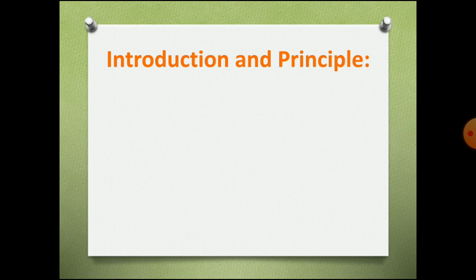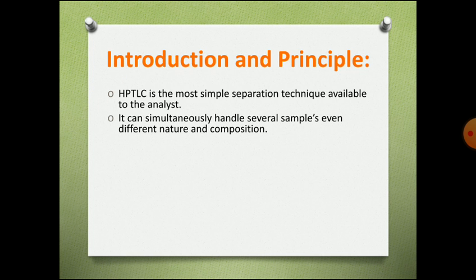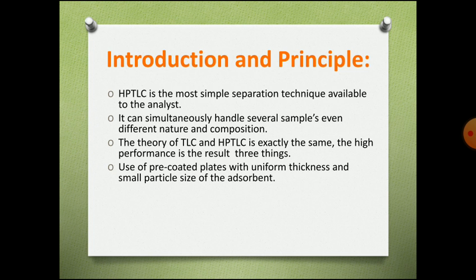HPTLC is the simplest separation technique available to the analyst. It can simultaneously handle several samples, even of different nature and composition. The theory of TLC and HPTLC is exactly the same. The high performance is the result of three things: use of pre-coated plates with uniform thickness and small particle size of the adsorbent.